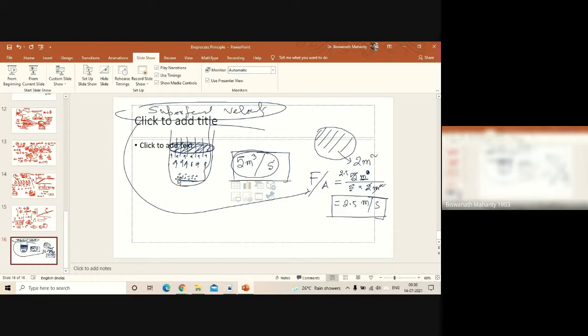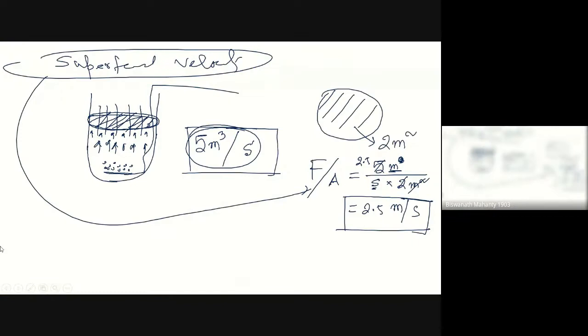So same thing happens, the bubbles need to have some time. Okay, the bubble is rising, right? You try to understand. So for example, I'm just talking about one bubble. This is a very big air bubble. What is inside? Air. So what will happen? Air from this bubble will go inside and dissolve, right? It is like a liquid film. Film theory, I will talk about mass transfer later on in our class. So what will happen? Air should get dissolved, and for dissolving it needs time.